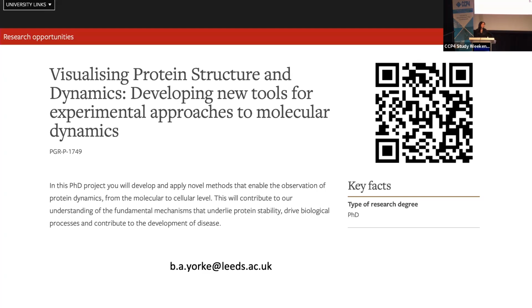I wondered about the chaperone protein that you mentioned, and where the interface with it is on what you showed us, if that's known, and whether that could affect the movements that you're seeing. Yeah, the chaperone protein is really interesting. It forms oligomers, but it deliberately appears to form oligomers of very varying sizes to prevent crystallization in the lens, because it's at such high concentrations.